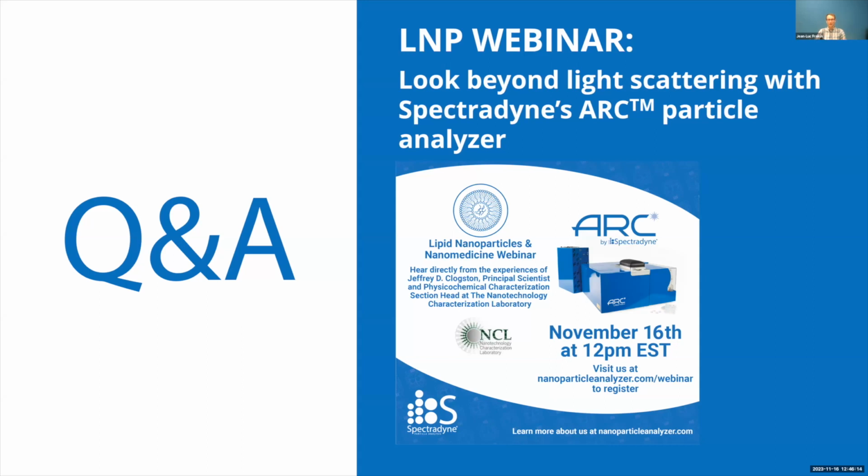So if the sample is homogeneous, which we have to assume for any measurement technique, then the uncertainty in the measurement is only dependent on the number of particles that are detected. So assuming you count enough particles, then that defines the certainty of the measurement. So hopefully that answers your question.